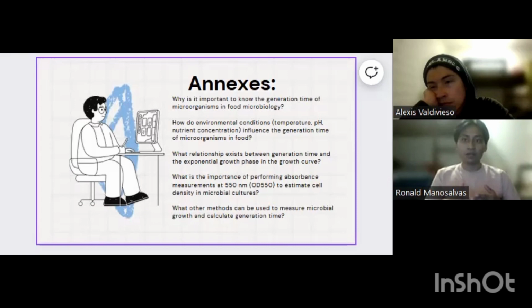It's possible that some bacteria die and some bacteria in other conditions are affected and float in the medium. Okay. It's possible that the control of these bacteria in food is very interesting in the control because some people eat all of the different products today.